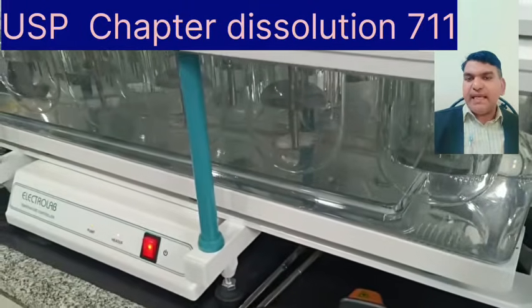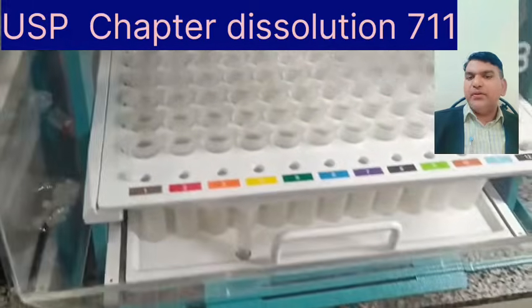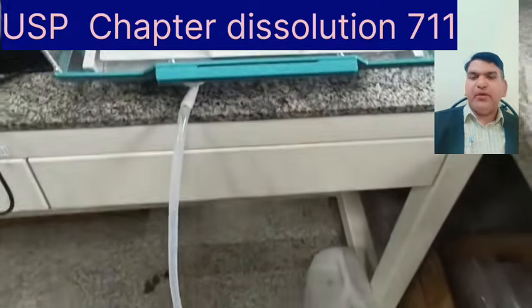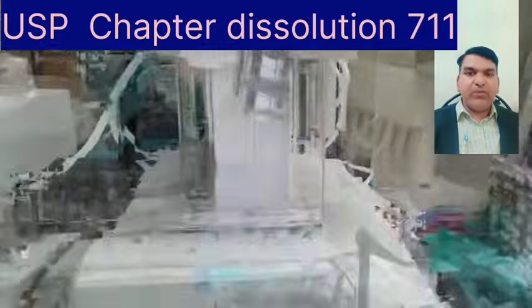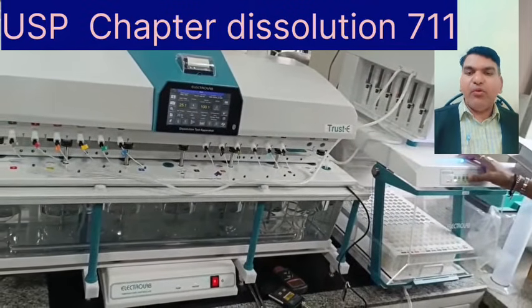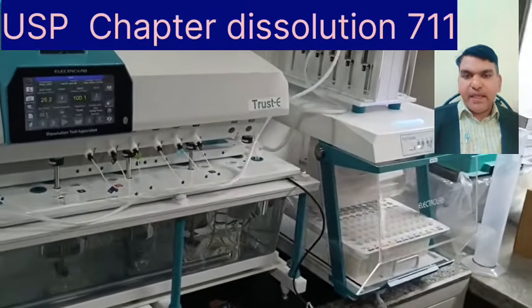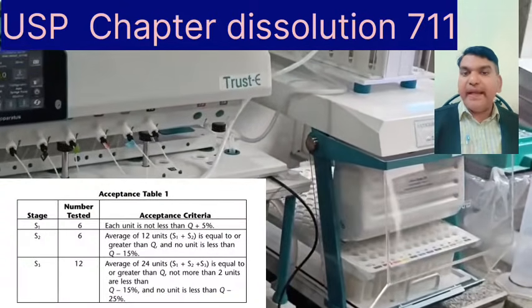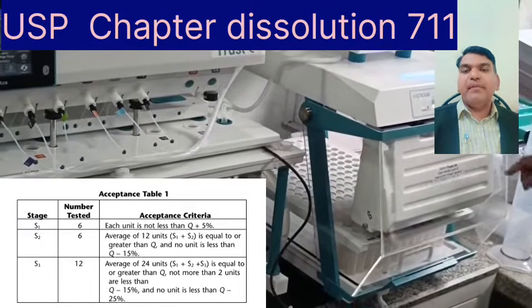Let us see the USP dissolution acceptance criteria for immediate release dosage form. Let us assume, for explaining this example, that the value for our Q is 85%. If Q is equal to 85%, then you have to express the specification as not less than 85% Q, where your Q is 85%. Acceptance criteria for this product through three different steps will be as below.